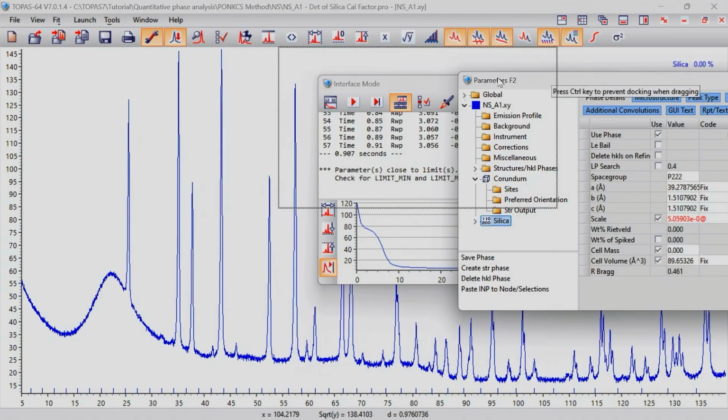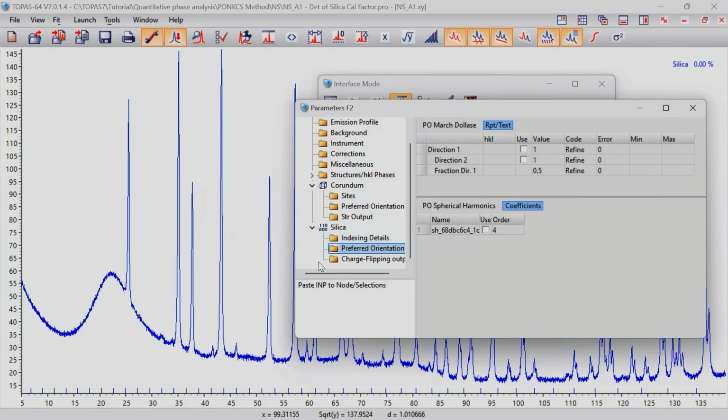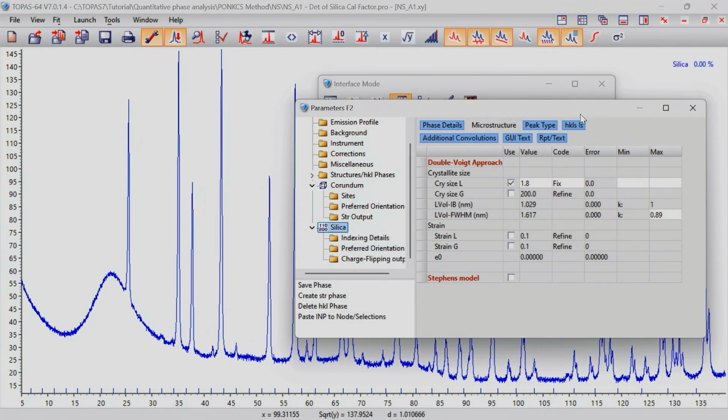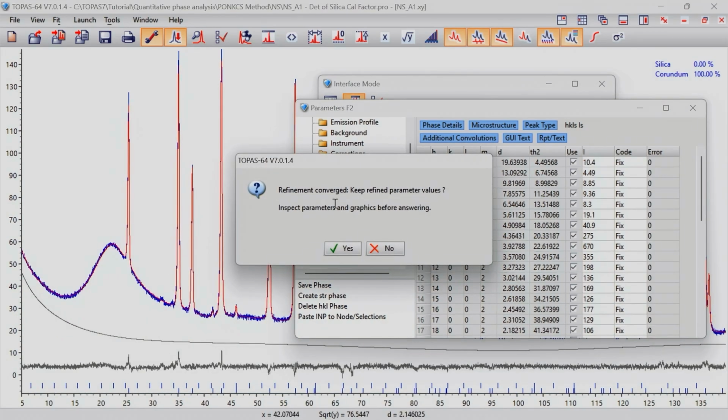So remember, this is a Pawley or a Le Bail refinement. I'm dealing with refinable individual intensities to do a Pawley refinement. So what I need to do is, where's my list of peaks? It is here. Once I've done the refinement of my envelope function, I have to fix all intensities as refined because they represent, obviously, the unknown phase. So just run it again.